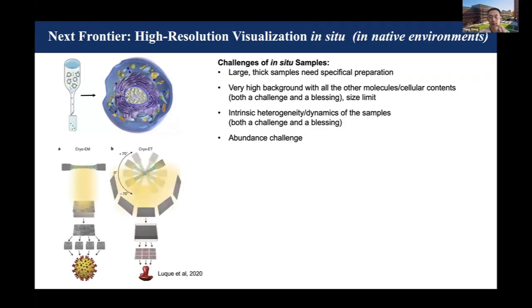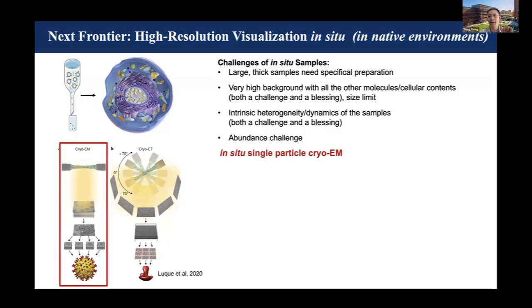So as Grant already mentioned, you learned single particle cryo-EM in the past couple of days, and today you start hearing the great power of cryo-ET. What I'm going to introduce today is a method sort of in between the two. Really, we're going to use single particle cryo-EM to deal with in situ samples. So hopefully we can bridge the gap between the two.